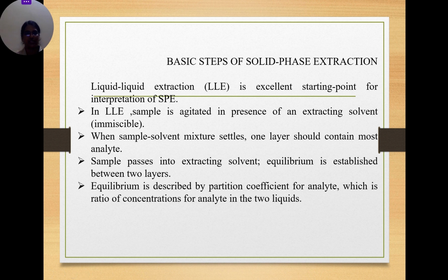So what are the basic steps of solid phase extraction? Here we can say that liquid extraction is also a significant starting point in the interpretation of SPE. Why is it a significant step? Because the sample is agitated, that means it is mixed in the presence of an extracting solvent. It is an immiscible solvent, and this solvent will be used as the extraction solvent.